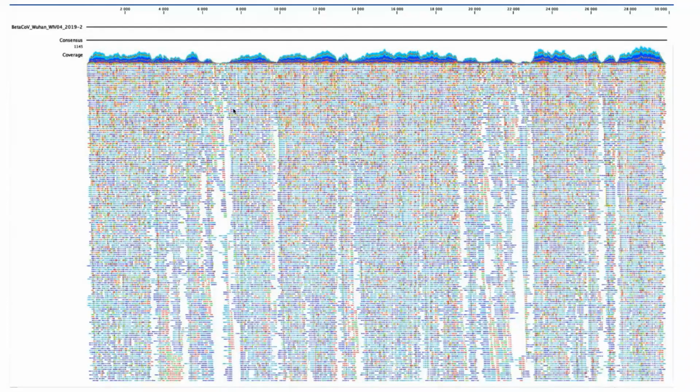So what are we seeing? We are seeing here the output from next generation sequencing. And it is indeed alignment, but it's not multiple sequence alignment. This is alignment of reads to a reference genome. So these small pieces that you see here are reads. Those reads are short portions, anywhere between 30 to 300 nucleotides long, and those have to be assembled into a genome. So one easy way to assemble a genome is to map it on a genome that we know is closely related.